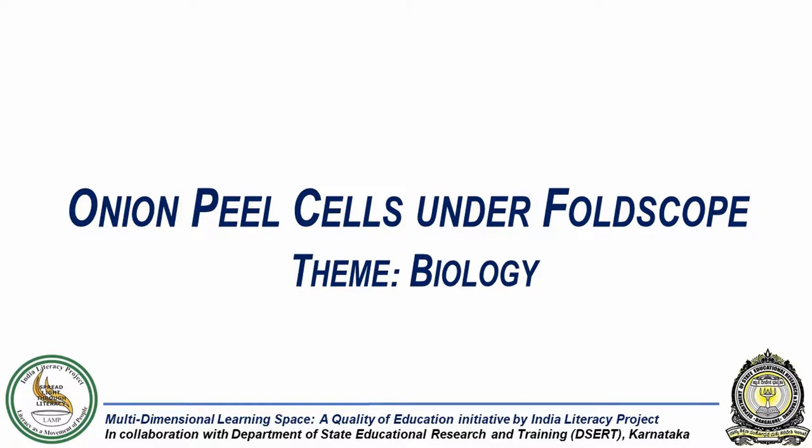In this experiment, we will observe the cell structure of an onion peel.